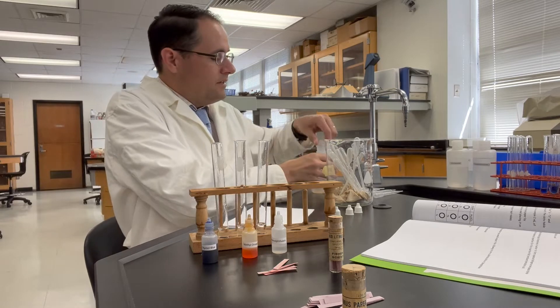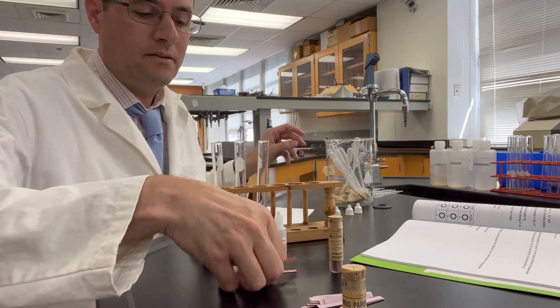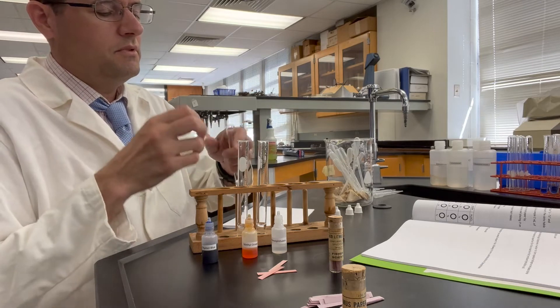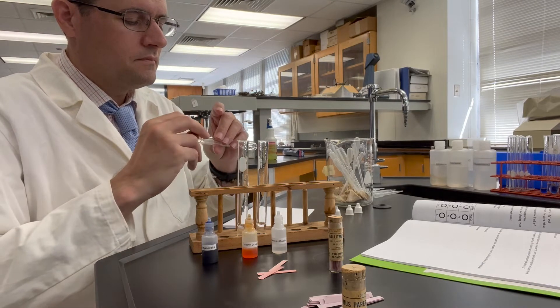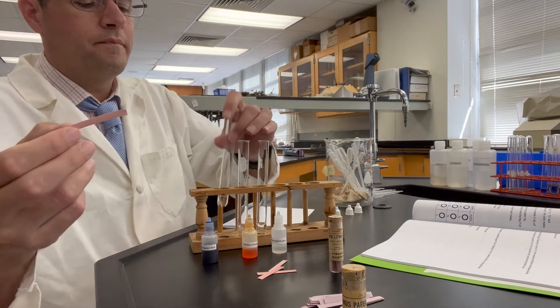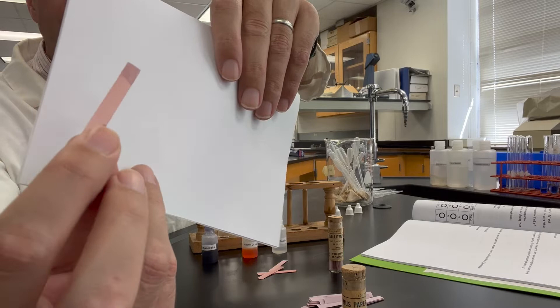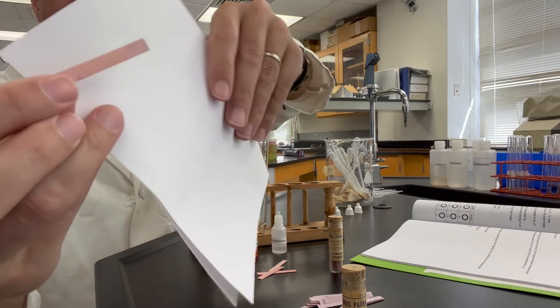Let's go ahead and test the solutions using red litmus paper first. So that's red. I'll dip this into sodium acetate. The tip of that is wet. So that's the color of red litmus paper in sodium acetate.